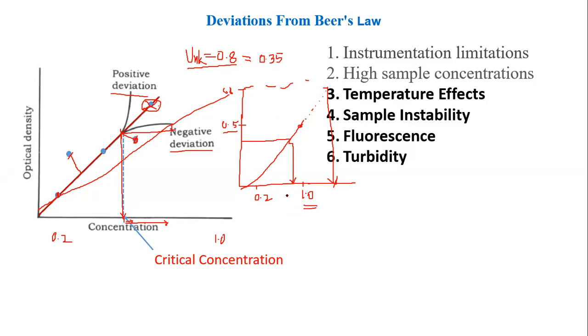And whatever the concentration I get here, say I get X concentration, I just multiply it with the dilution factor, which is 2. And I get to the actual concentration. Is it good enough? Yes, sir. Okay, what I am ensuring when I am doing this?